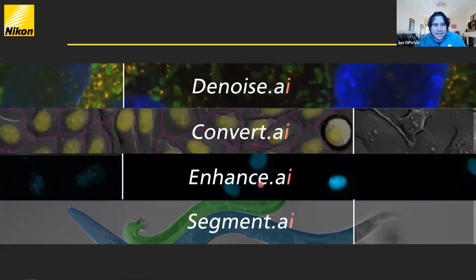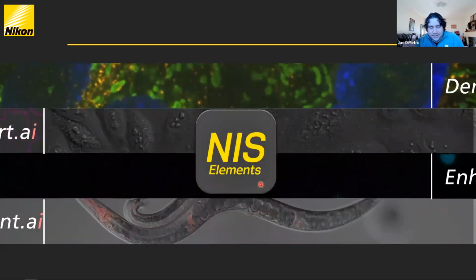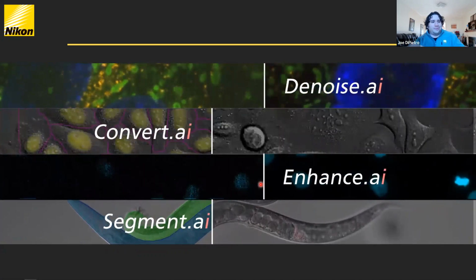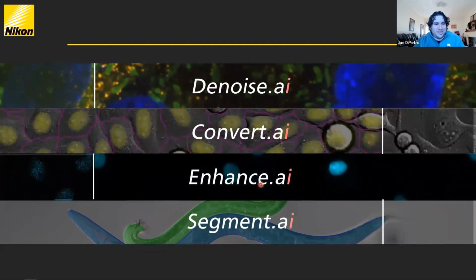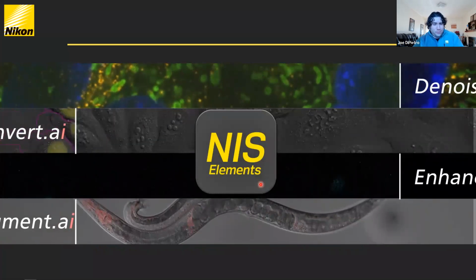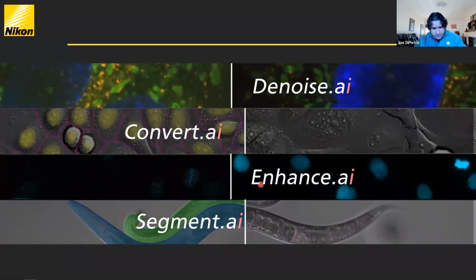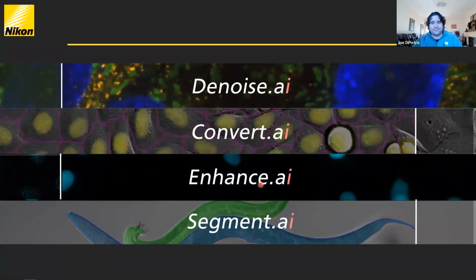We're looking at the data and we're saying, these are the cells that we're interested in. We know that this is what we want to measure. And then we try to play with different parameters on a computer to teach the software, hey, we want to see this, or we want to focus on these structures, right?